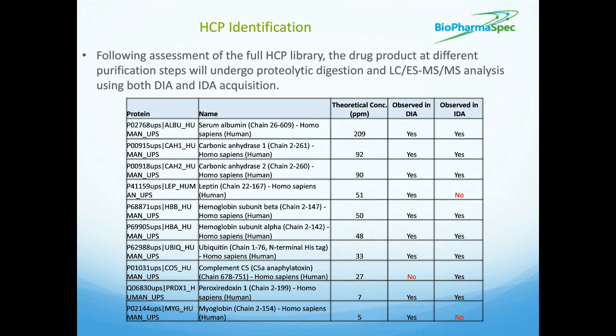So in this case, we collected our data-independent method data and screened it against the data-dependent data. So we matched against retention times and B and Y ions. So it's important to know that the data-independent method was able to detect down to a lower level than the data-dependent method.